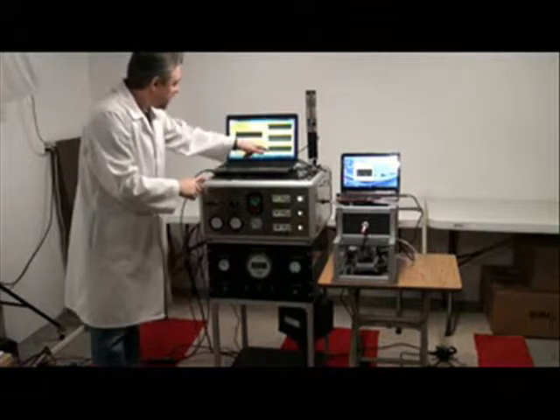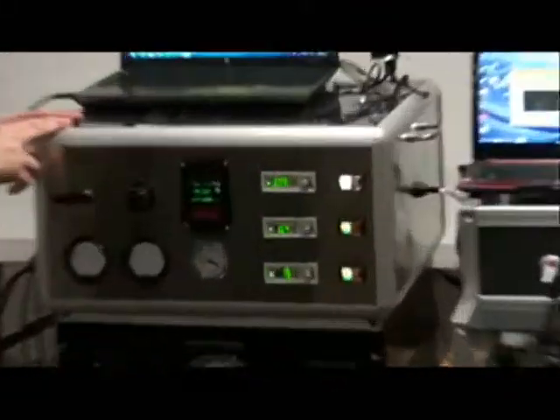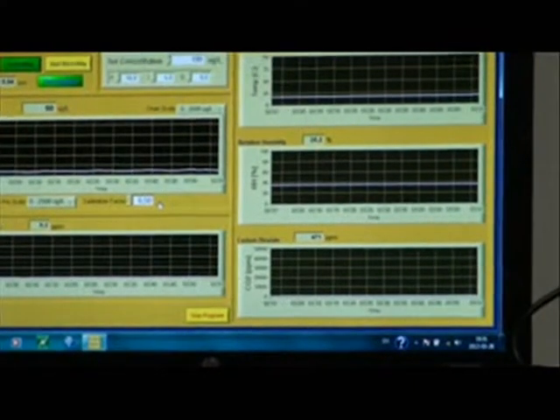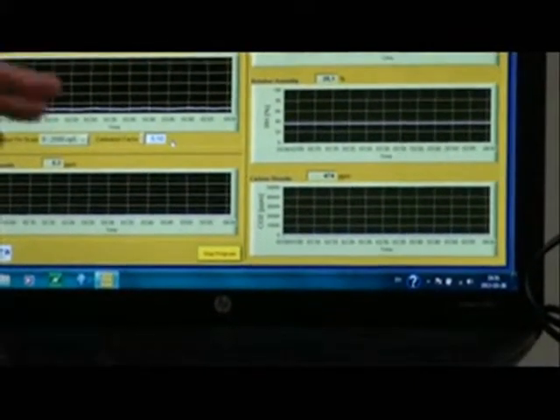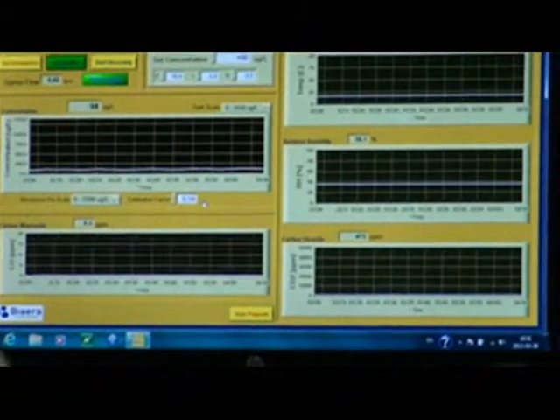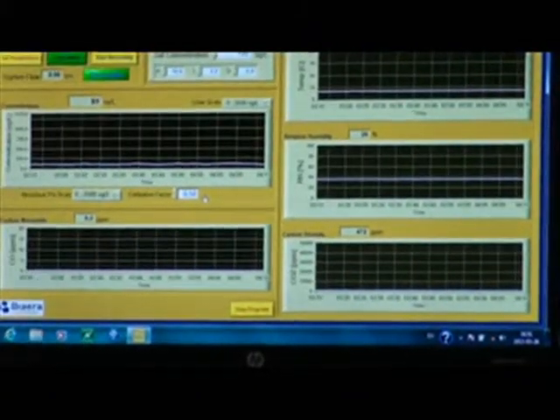As you see here in the other time chart, we have the readings from the gas monitor, and all this data is integrated into one single data output file that is saved as a text file in a computer. That way we can go back and access the information to see the performance during the whole smoke generation and exposure period.